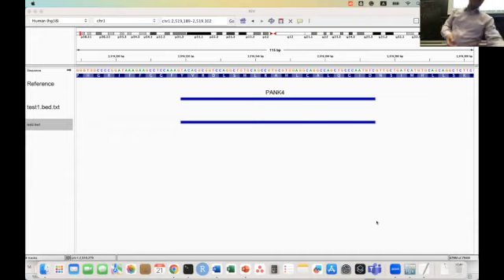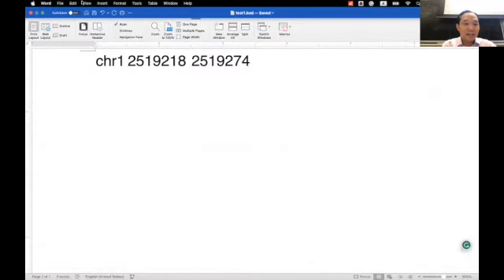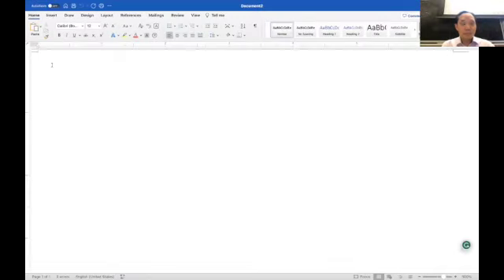Yeah, let's try then. Let's try a new document. Greater than sign. And yeah, let's just do chromosome 30 of some new organism, not the human.